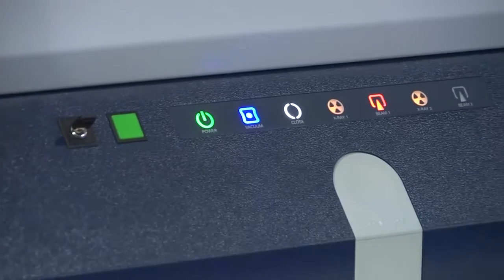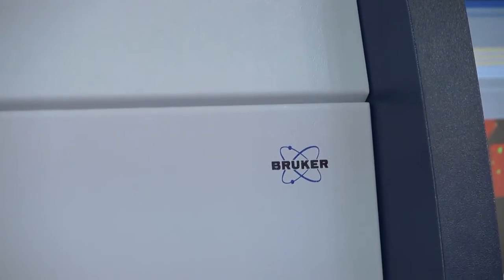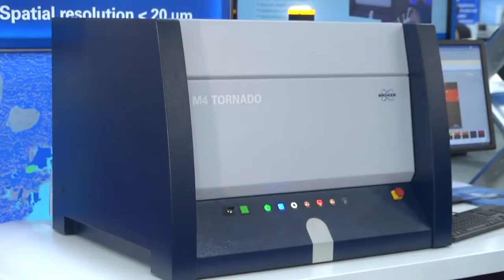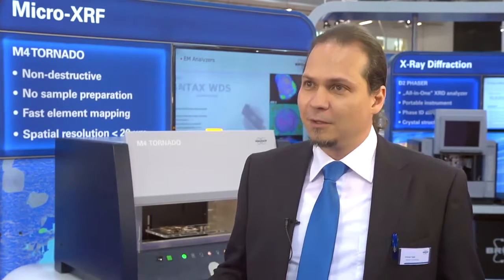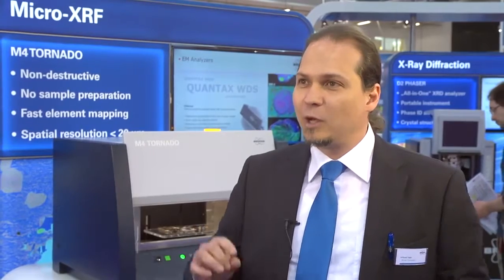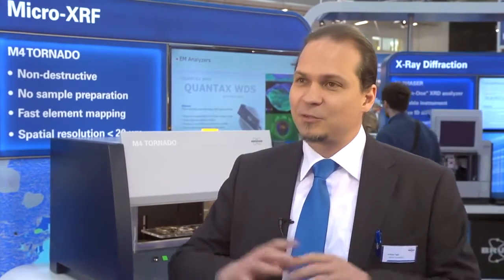The M4 Tornado, and let me just go a little bit backward in time, I have been involved from an application point of view with the M4 since the beginning. Now we have more than 4 or 5 years of working on the instrument. I have seen the development and introduction of the instrument in many, many fields. It's very difficult to give one key field where we have seen the instrument grow more and more, but it's spreading over many, many application directions.